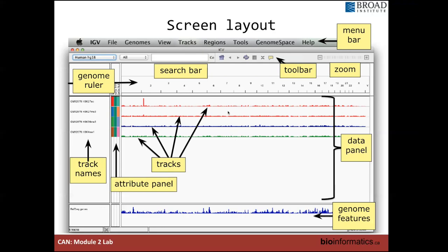The tracks, so each data set here, these are the actual data that you've loaded into the data panel, which takes up the bulk of the screen. Each data set gets a separate track in the middle, and the track names are indicated on the left hand panel. There is an optional attributes panel, we're not going to be using it today. But it is available if you want to, if you're looking at a bunch of different samples at once, and you want to distinguish them by certain phenotypic attributes or metadata, such as if it's a tumor sample or if it's normal. And then there's this genome features track along the bottom. And it has different annotations of the genome, such as the location of RefSeq genes.